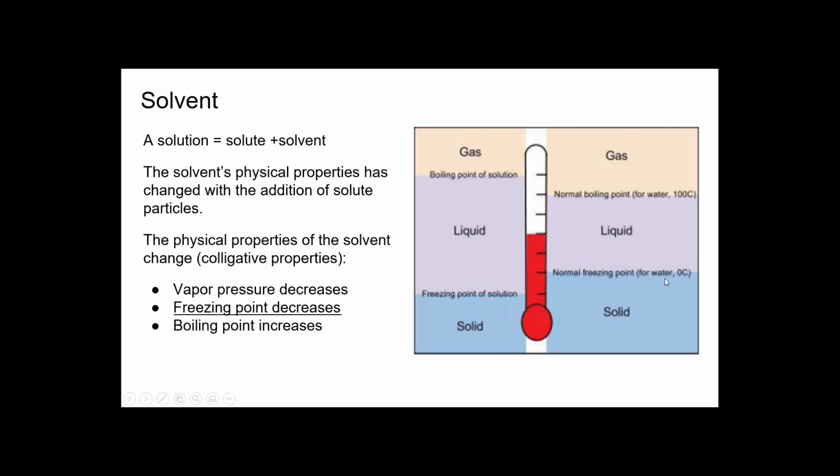Same as freezing. If water normally freezes at 0, but if we add a solute to it, a non-volatile which doesn't evaporate away easily, then it's going to push the temperature down, where it's going to have to go so much more into the negative range to get that to become a solid.